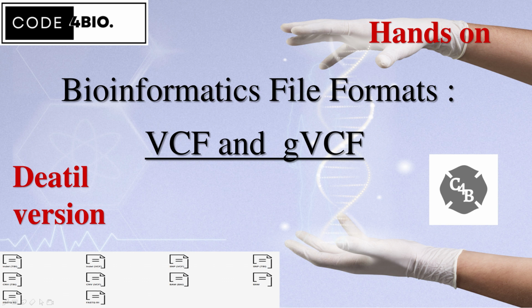Today, we're diving into the fascinating world of bioinformatics file formats. Now, you might be wondering, why should I care about file formats in biology? Well, my friend, let me tell you, this is one of the most crucial aspects of modern research and data analysis in the biological sciences. So, buckle up and get ready to have your mind blown.